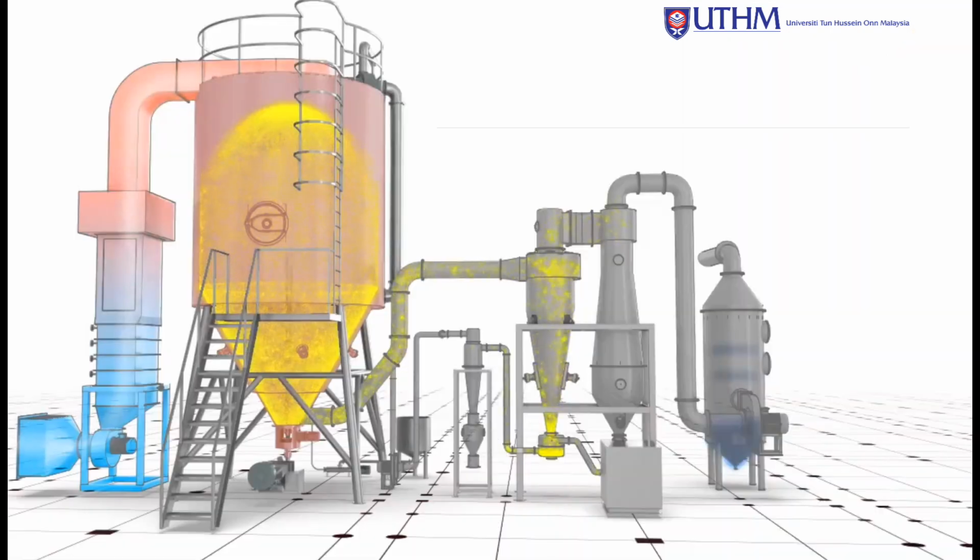The hammer is for removing sidewall build-up, clumps, internal surface blockage and powder discharge blocks in the spray dryer. The system control panel controls the process temperature and exhaust temperature to maintain a fixed temperature, preventing overheating.